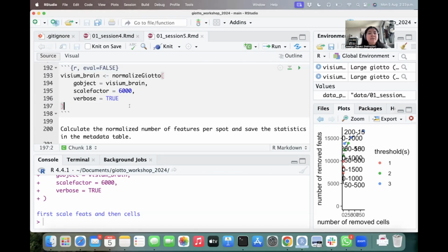So in the case of the normalized one, it's just going from 0 to the top of the counts in our data set. But in the scale matrix, we are putting 0 as the middle number, and from there it goes to positive values or to negative values in the case there are down expressed genes.